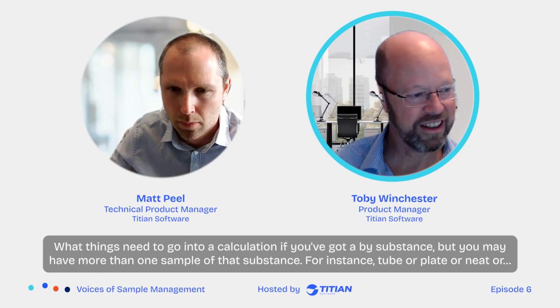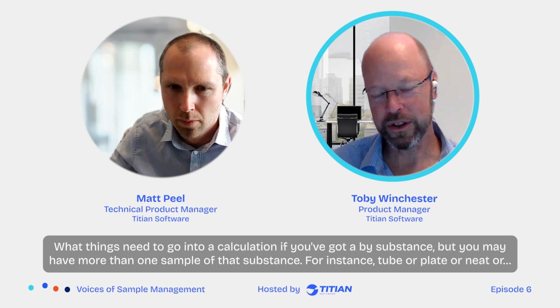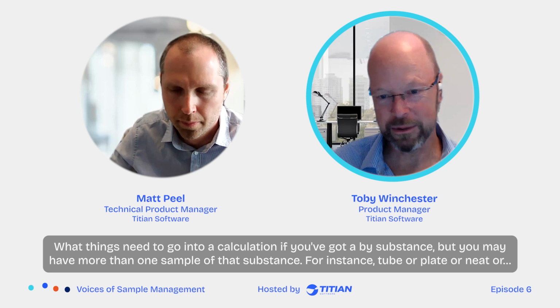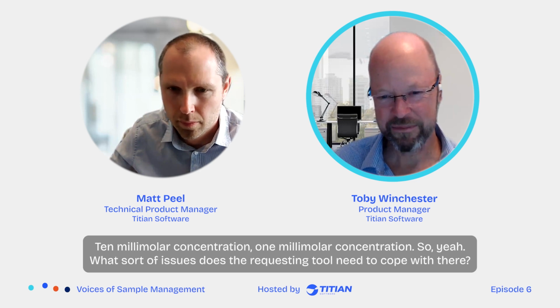Maybe this: what things need to go into a calculation if you've got a substance, but you may have more than one sample of that substance, for instance, tube or plate or neat or 10 millimolar concentration, 1 millimolar concentration. So what sort of issues does the requesting tool need to cope with there?